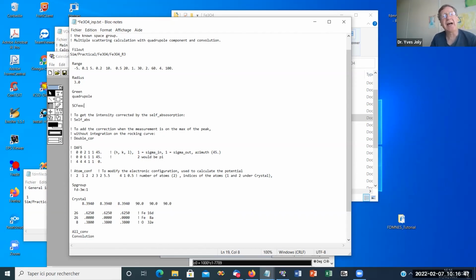Okay, so that's a next step. If you are still not happy, I said that in the self-consistent calculation without SCF-EXC, the core hole is considered, so you have the core hole plus a full screening electron in the first non-occupied level, but it can be that the screening electron is too much.